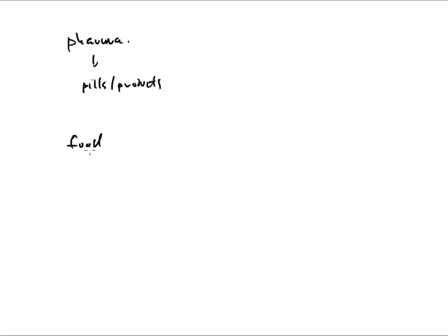When I say food, I'm also talking about the pet industry. So pet food can undergo an LOD as well. So any kind of hard, dry material that needs to stay dry, I mean, again, think of flours and those types of products. They have to undergo an LOD.